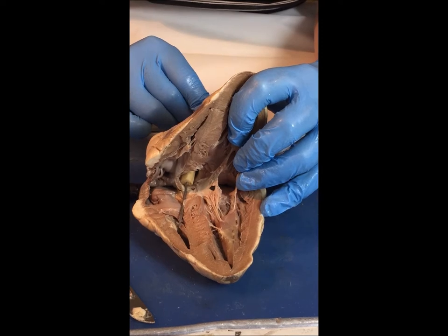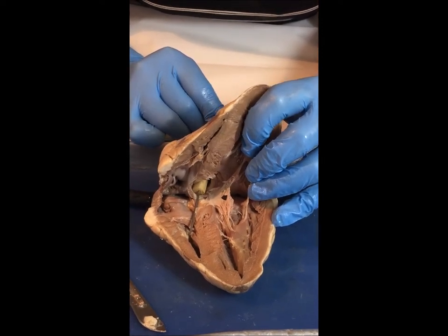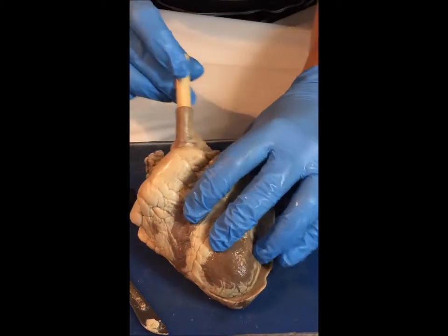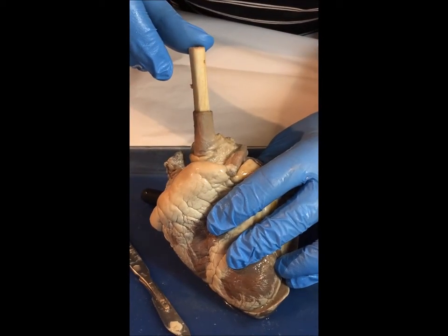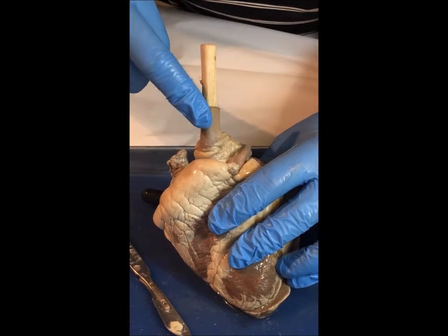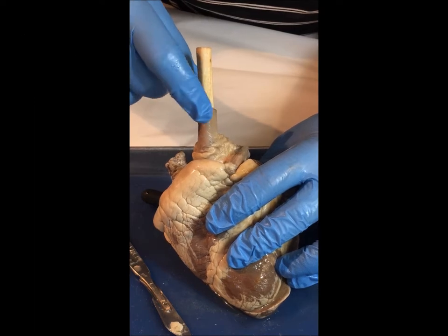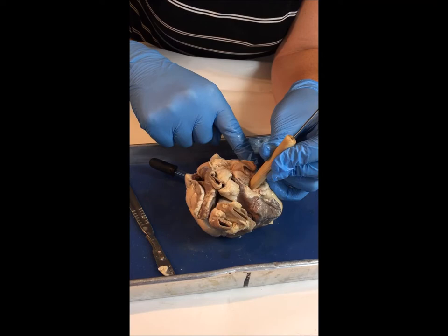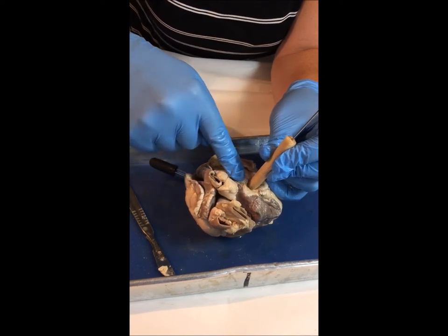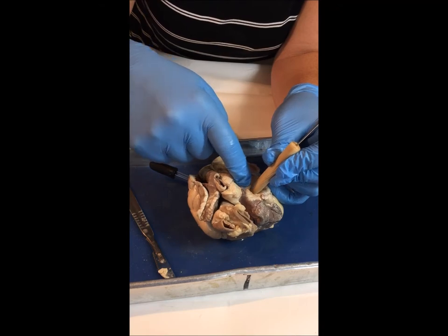You can see here that the needle is pointing to the right ventricle. If I were to trace that needle back up through the heart, we would see the needle coming back out through the pulmonary artery, going away from the heart. That's going to go to the lungs where the blood will become oxygenated. I'm now on the posterior side of the heart, looking at where the pulmonary vein will bring the blood back to the heart with oxygen in it.